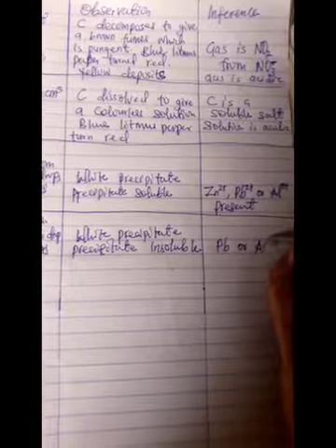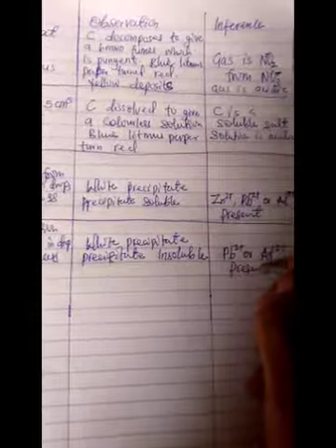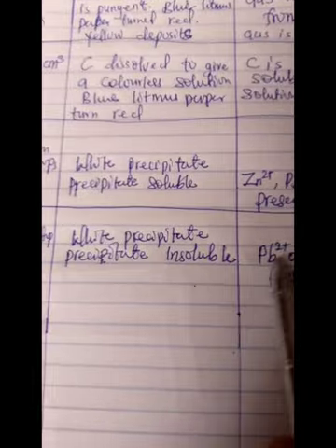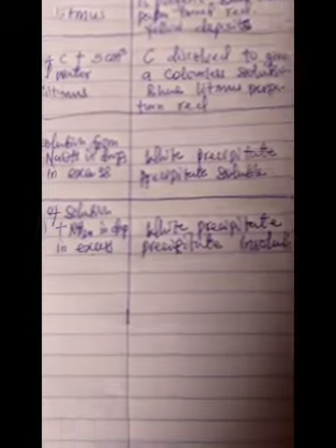So only lead ion or aluminum ion present. Remember, I'm putting these things at the SS. That is where they should be.